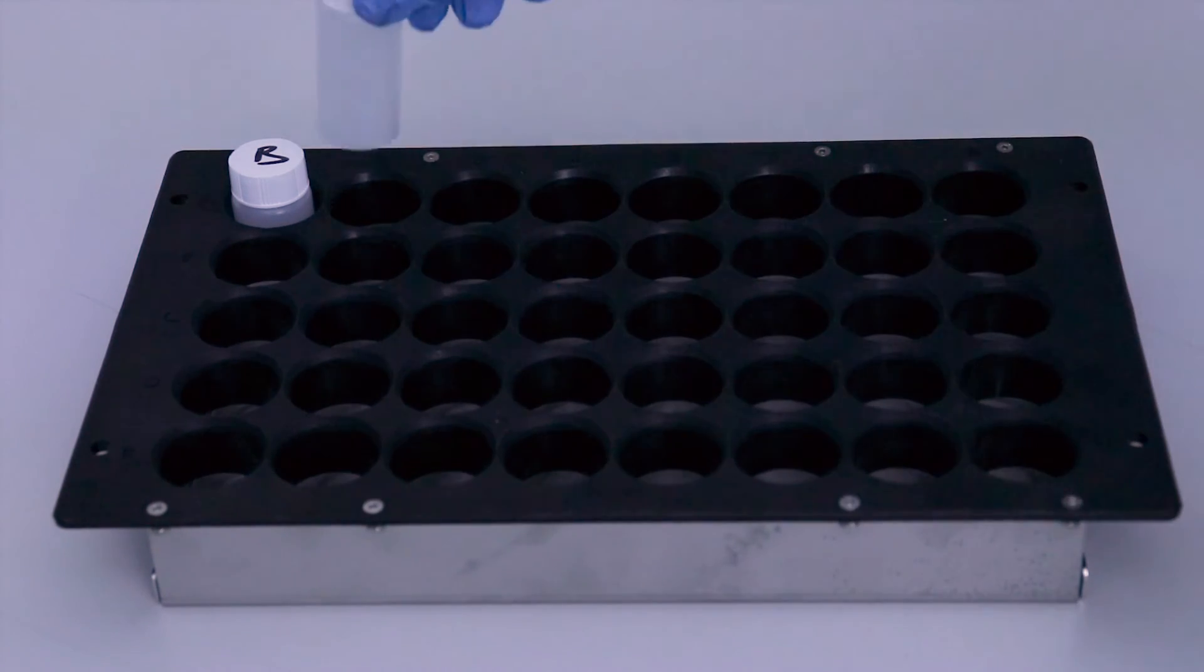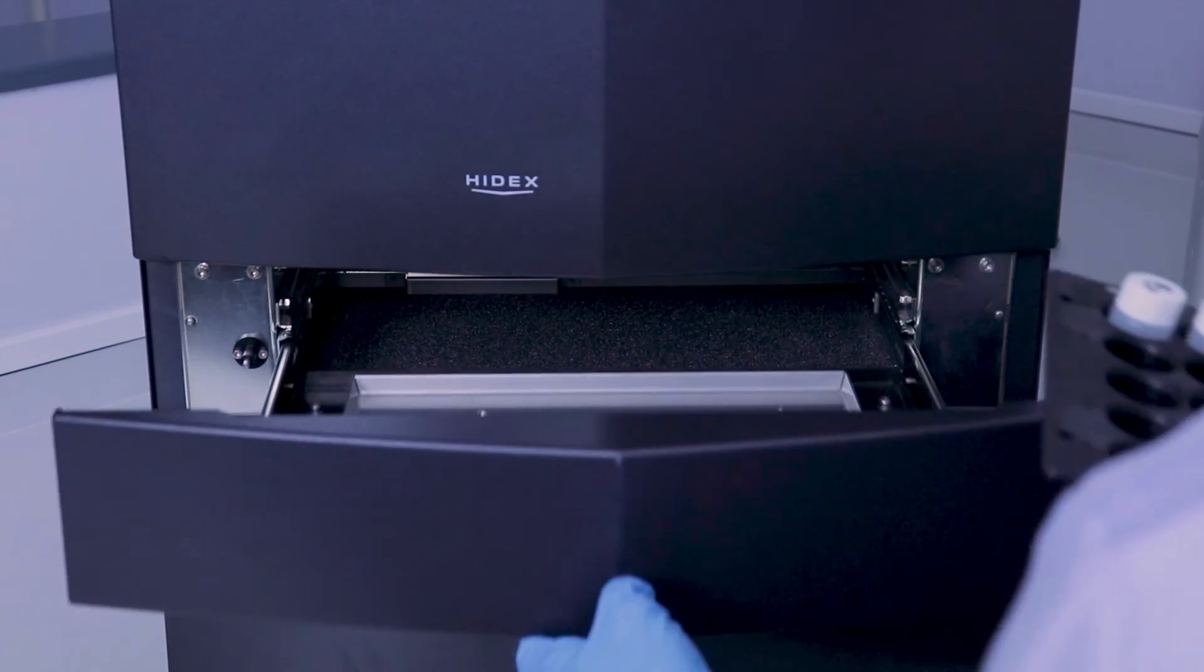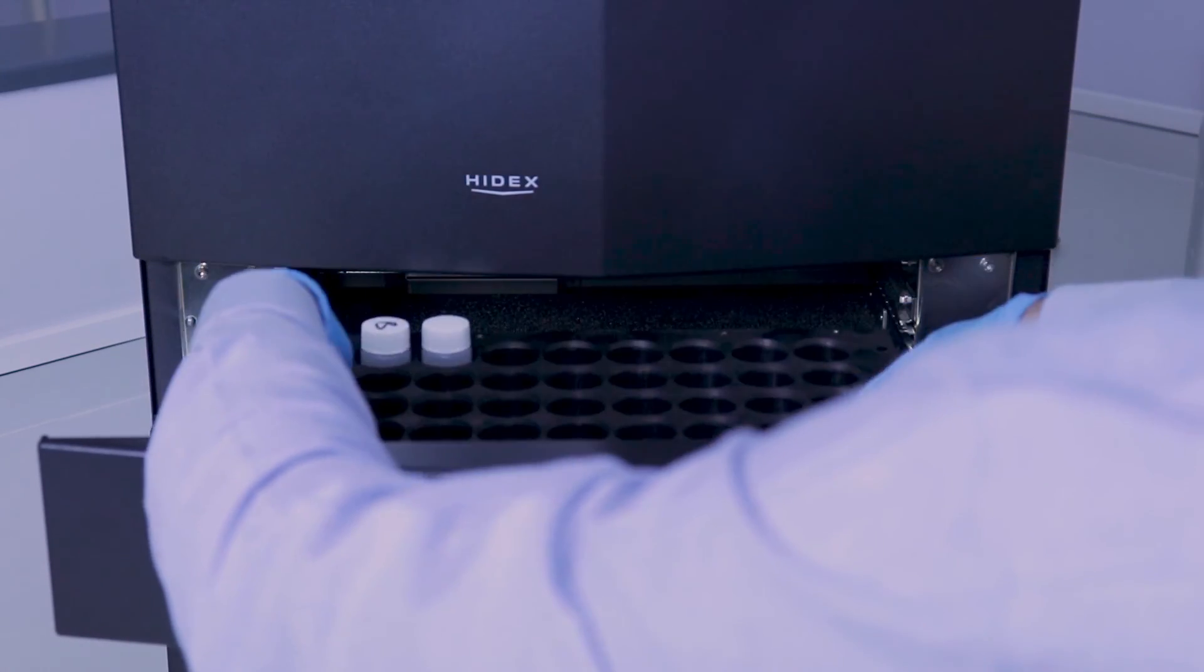Place in tray in sequential order. The first sample should be your background: clean wipe with cocktail only. The Micro Win software background subtracts the first position.